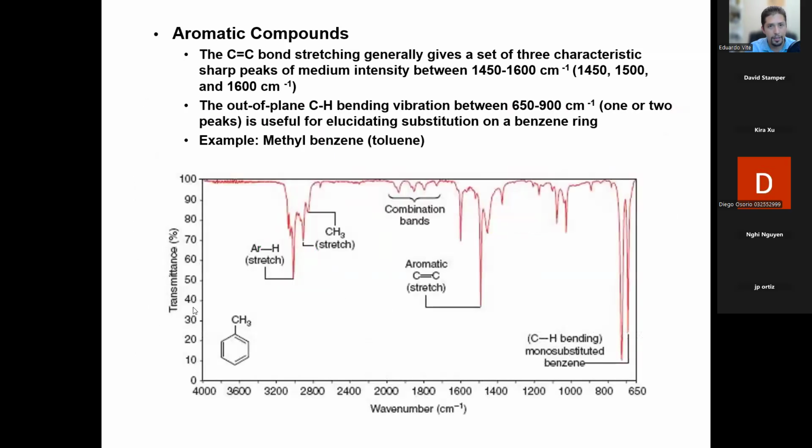I think I can just scroll. Yep. This one here is aromatic, right? Aromatic compounds. It still is a hydrocarbon, but now there's double bonds and sometimes there's rings. And actually it's a bond and a half because it's resonance. So notice that you also have the stalactites right over here. You have like this region that looks like the stalactites on a cave, you know, the little pointy rocks on a cave. That's what I call them.